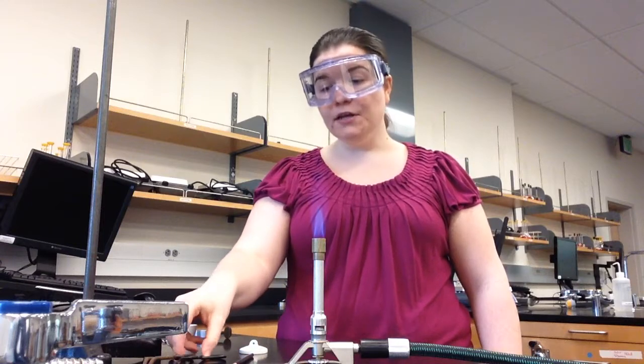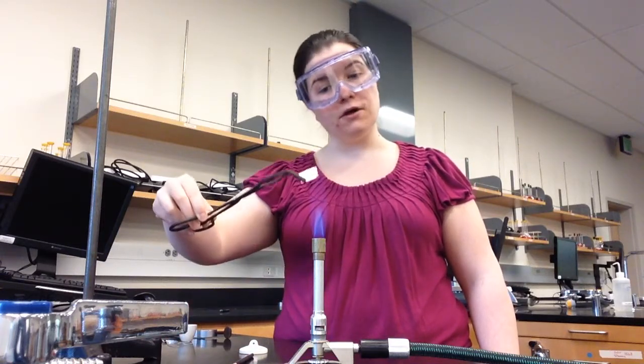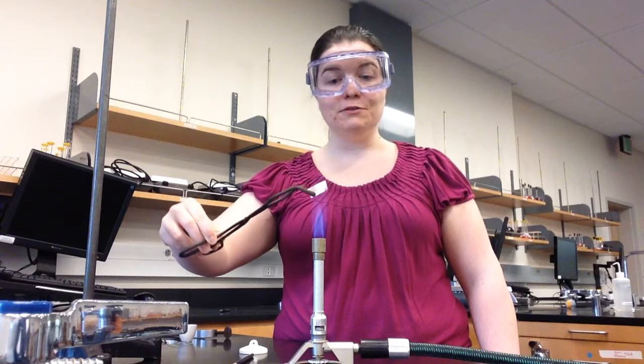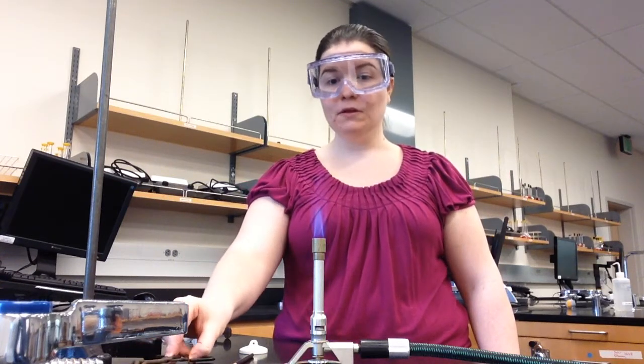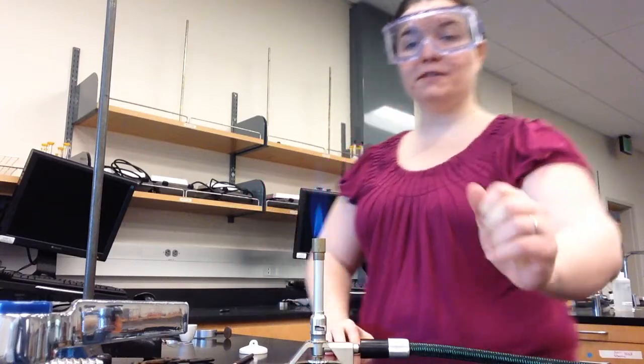Once you've done that, you can then put a piece of copper metal using tongs into the Bunsen burner to determine if heating a piece of copper is a chemical or a physical change. Once you are finished with part 1, you can turn off the Bunsen burner.